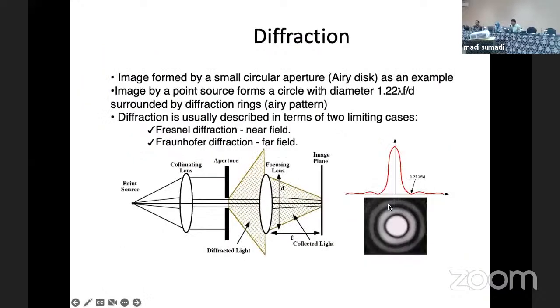So the second thing comes with a little bit of physics, but still we can talk about image diffraction, because this is required for the confocal microscope. In normal light microscopic techniques, you do not have this range of diffraction because of the airy disk. But if you work with a confocal microscope, you normally set the airy disk to one, so that the diffraction will actually be neutralized.